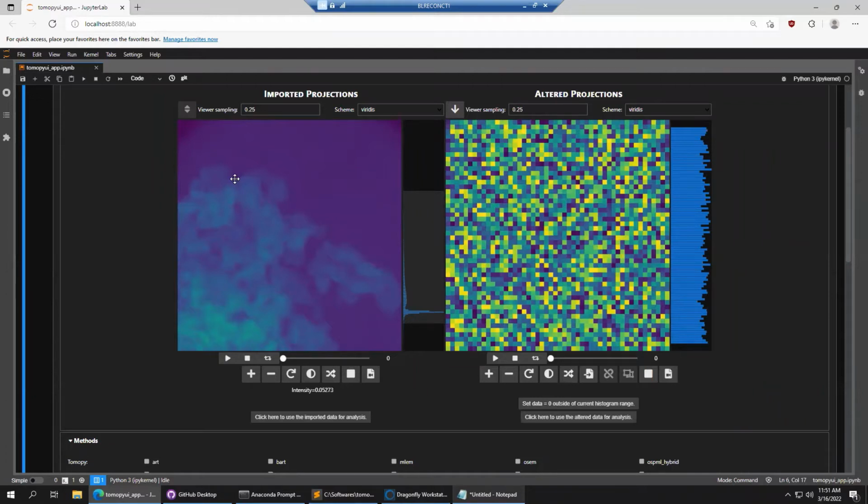And you're trying to match that reprojection up with your original data set here. So this process can be really slow if you use your full data set. And so the idea for this tab is to reduce the amount of data that you're throwing into this algorithm, so it's much faster.